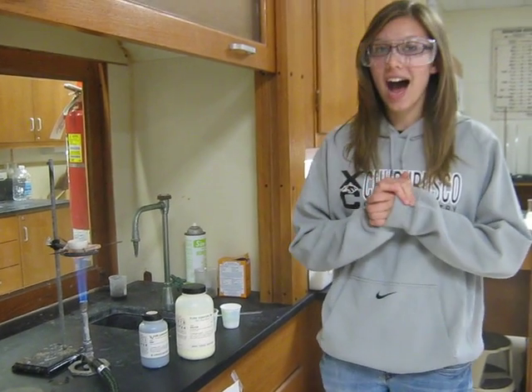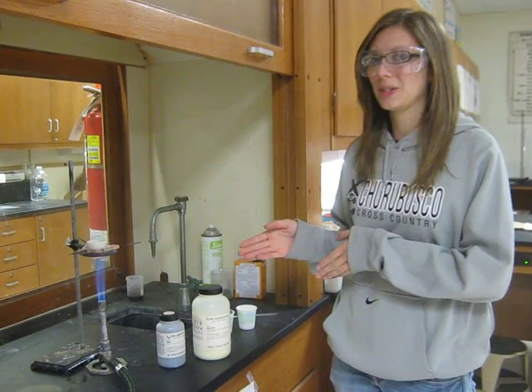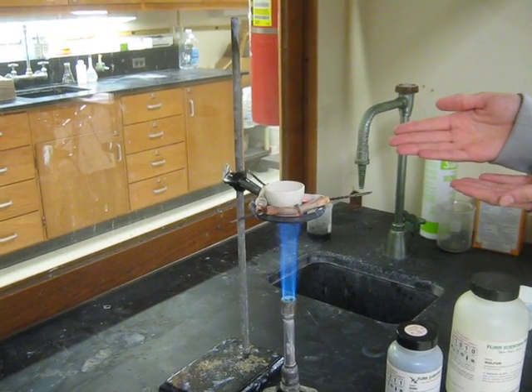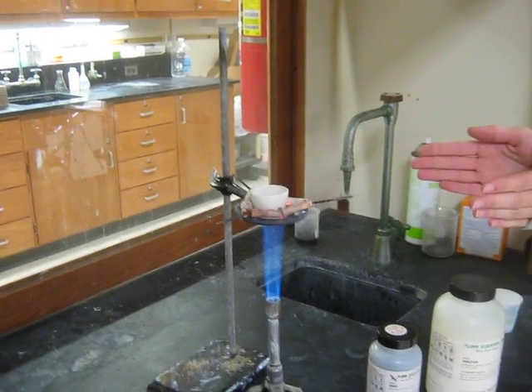First, I turned on my Bunsen burner to heat my crucible, which is held in place by my ringstand, iron ring, and clay triangle.